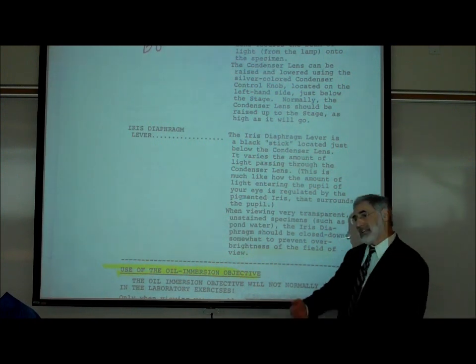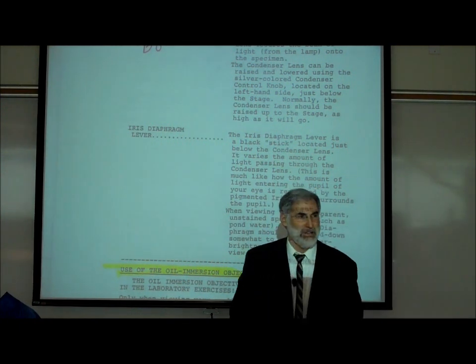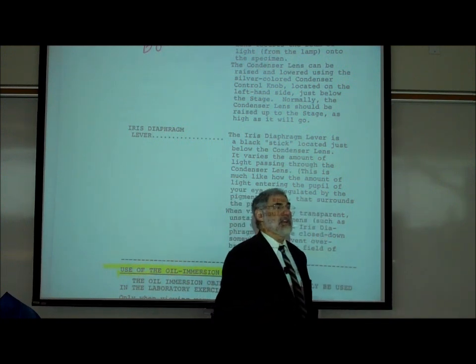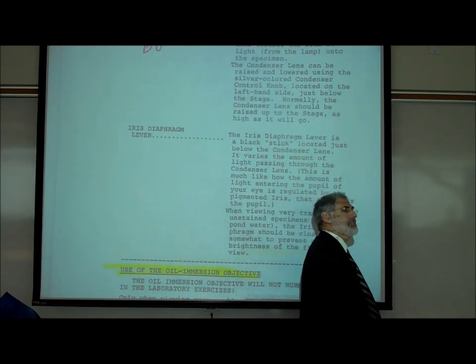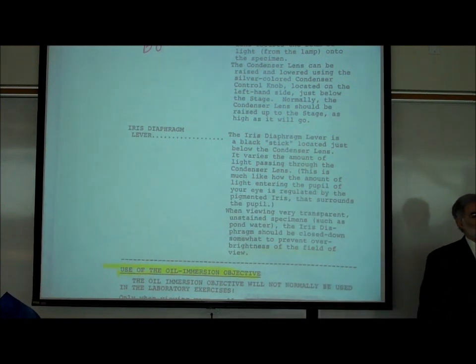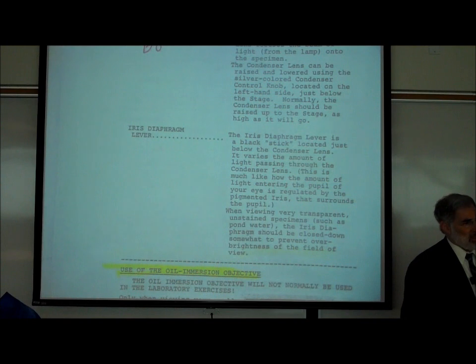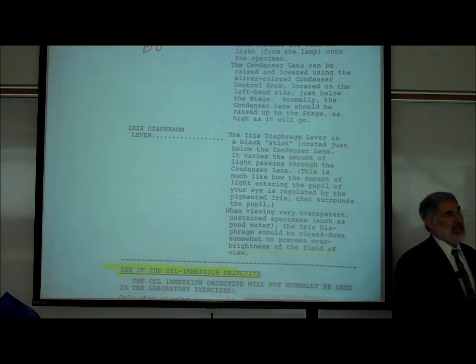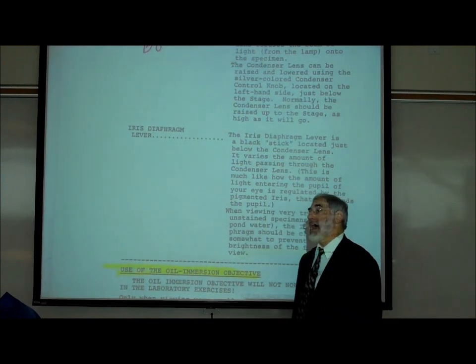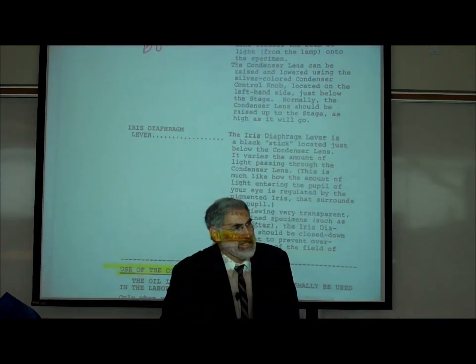As you turn it, it changes the amount of light going through the condenser lens, allowing you to adjust how much light passes through.